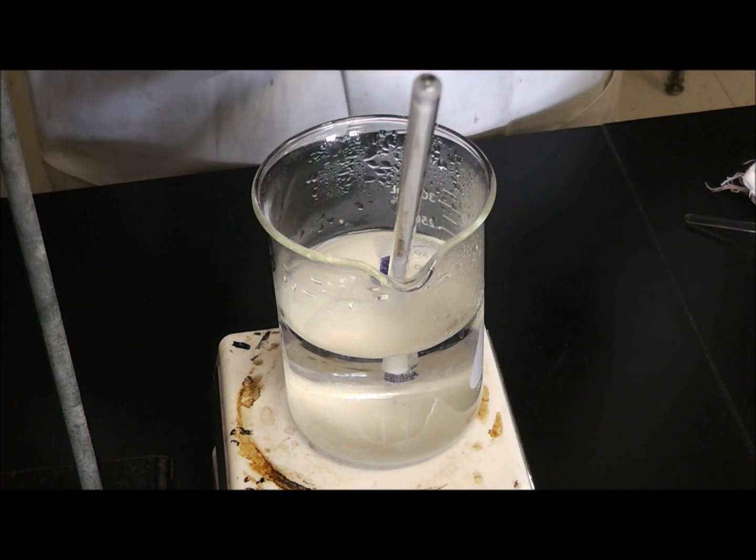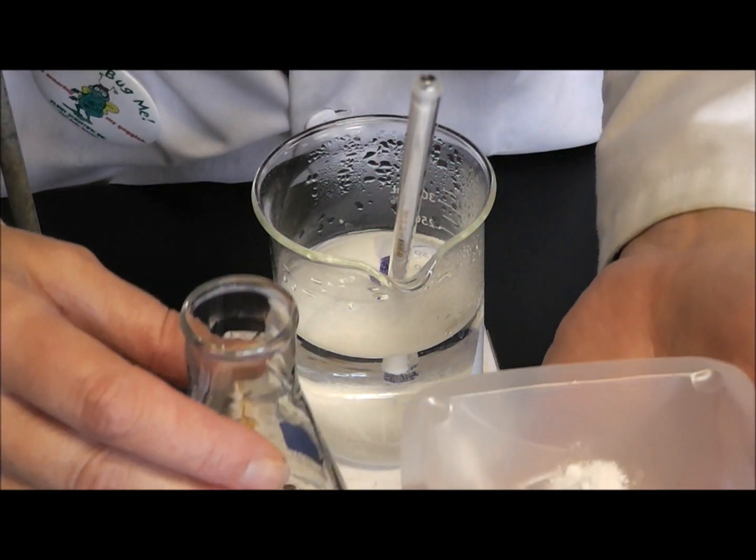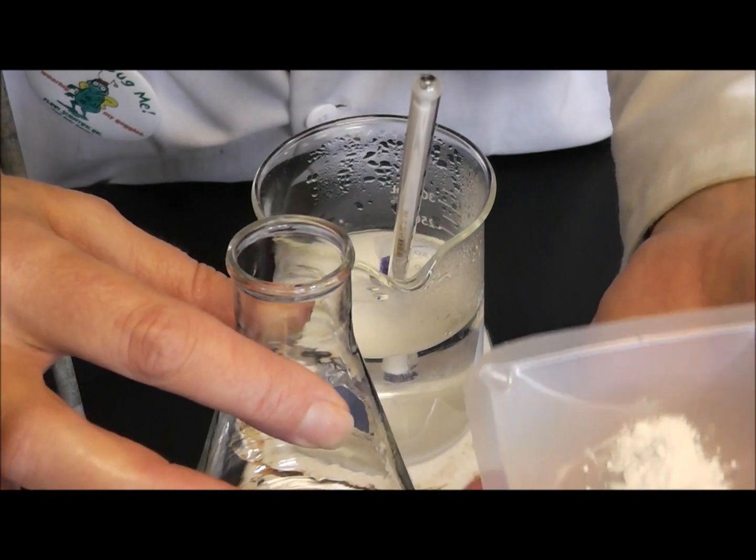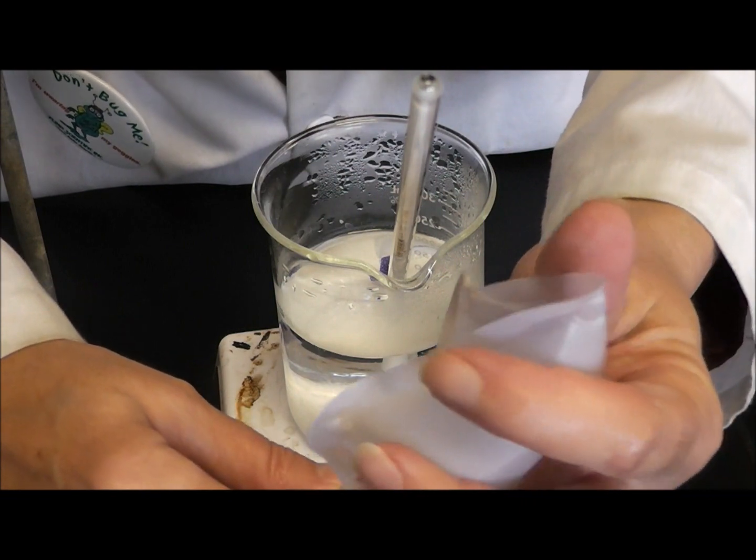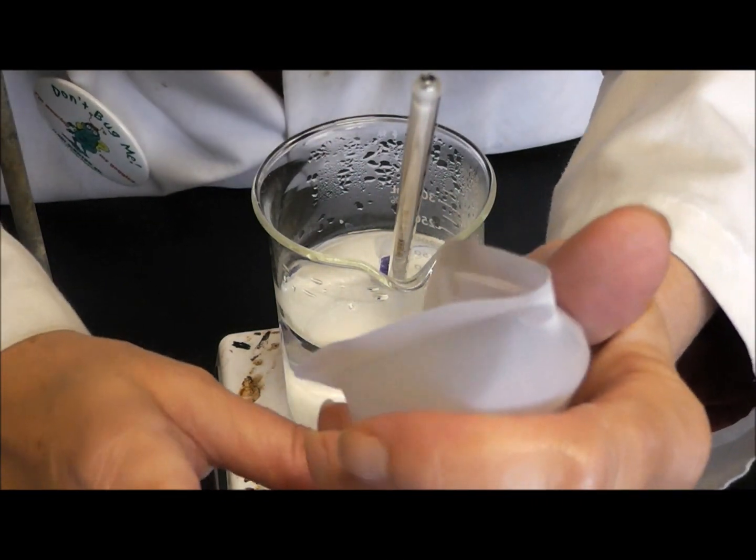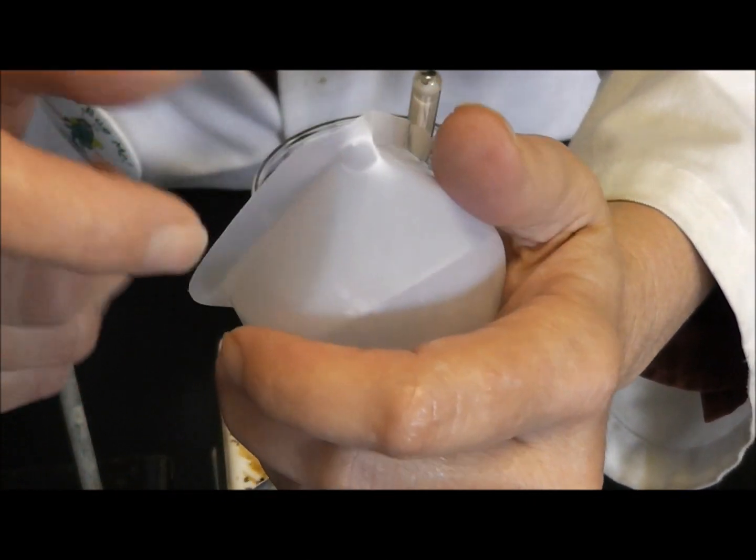What I'm going to do is, I have 1.5 grams of the salicylic acid in my weigh boat here, and I'm going to place that into a clean, dry Erlenmeyer flask, and give it a couple of taps.